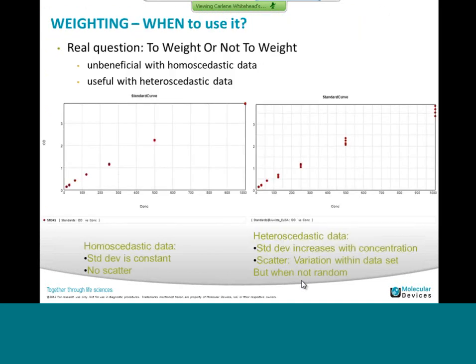So how can we look at the data and determine which needs to be weighted and which doesn't? For the record, some statisticians will even tell you that even not weighting the data, you are still applying a factor of 1, and therefore you cannot really say that you are not weighting, because there's still a weighting factor involved. But here, for the simplicity of the presentation, we're going to say that if we're not applying any additional weight, then it will be no weight. And if we are applying a factor different from 1, then it will be a weighting factor.